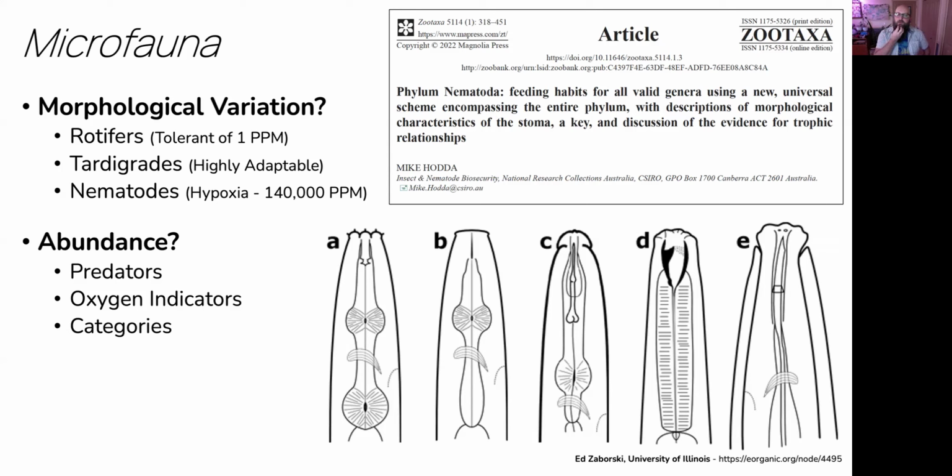So again, if we put the stress on the measurement, then we have to get absolutely every single nematode ID correct, or we might come to the wrong conclusions. But if we're looking more for diversity, and if we accept that some of these organisms take years of study to learn how to identify, then they can still tell us something about our soil, right? If we go from no nematodes to a bunch of different nematodes, we're going in the right direction, right?